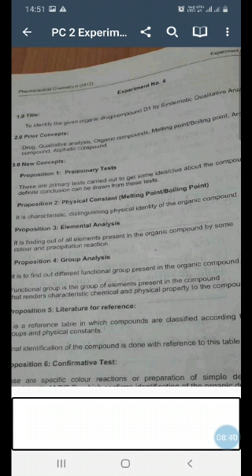Suppose I have carried out the group test for all the compounds which are mentioned against group 1, and my result is negative, no positive result. Okay, no problem. Next, see to which group your compound belongs. My compound belongs to group 3A. Then again I will see which names are there against group 3A.